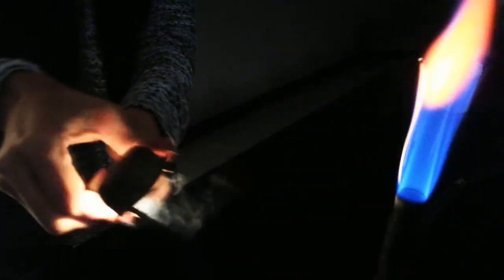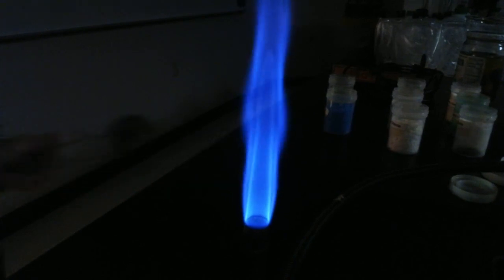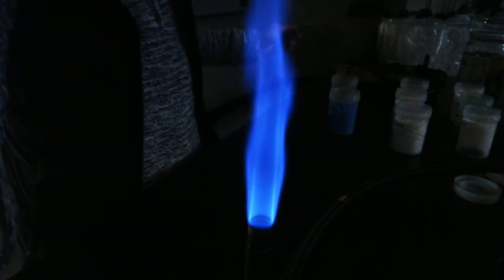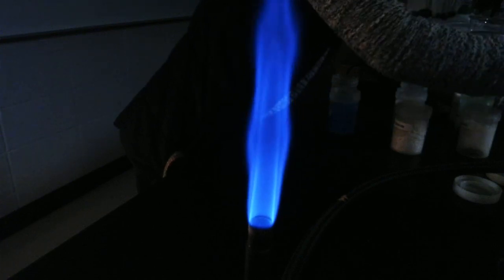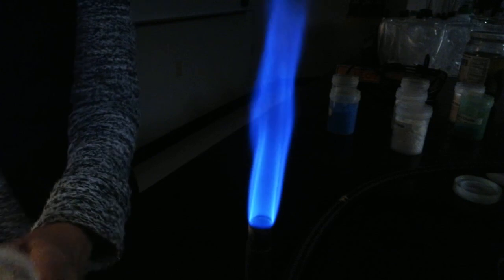Okay, so perfect. I'll bring this down. And I'm going to light the burner. There it is. That's not too bad. Get the camera in the right spot. I like it. Okay, so then I've got some Q-tips. Q-tip, there it is. And I'm going to just wet the end of the Q-tip. And then I'll put it in a solid chemical.